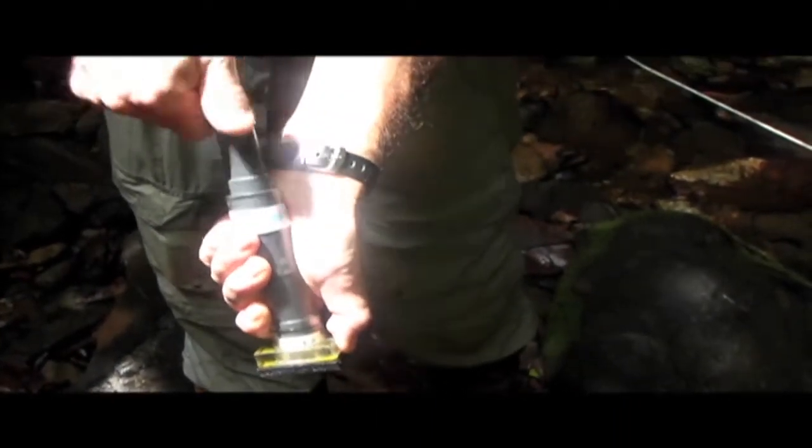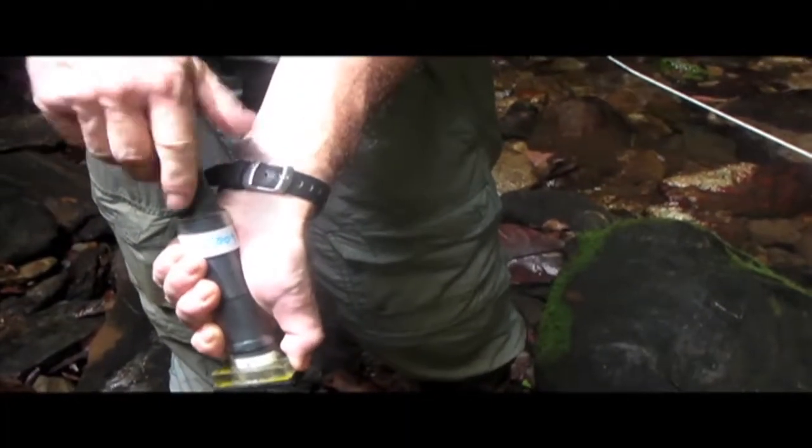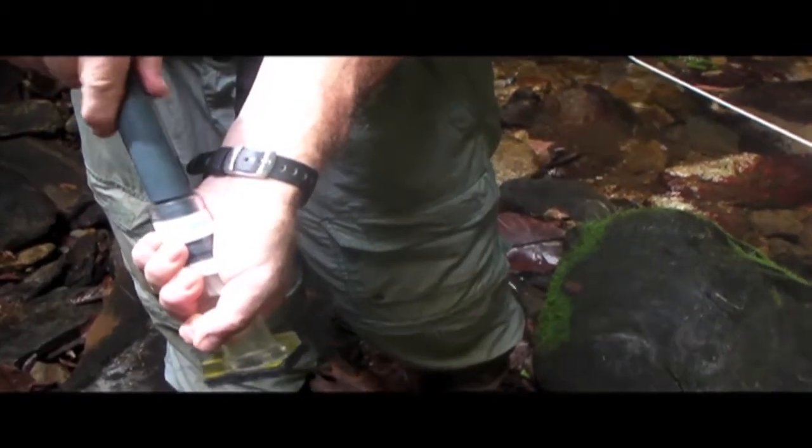And so what I'll do is I'll put my finger over the hole like this, and then I'll press it down on an environmental surface, crank the brush 5 times clockwise, 5 times anti-clockwise, take my finger off the hole, and pull up the plunger so that it fills with water.